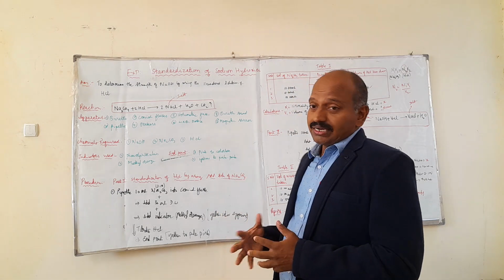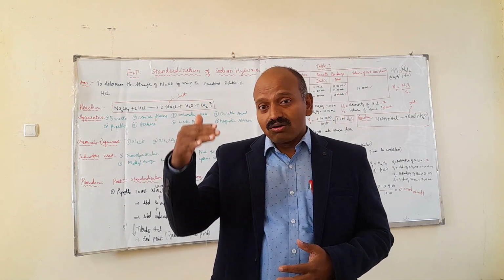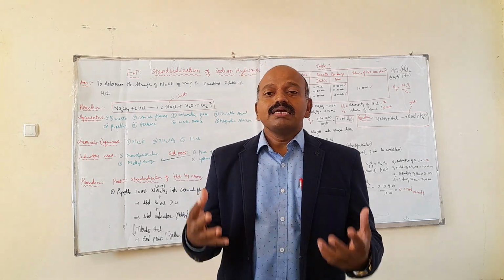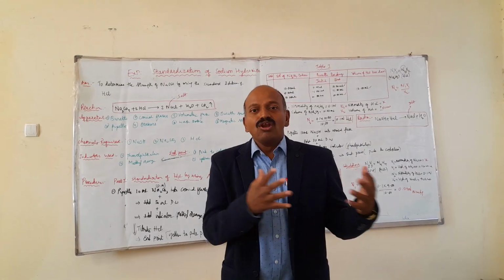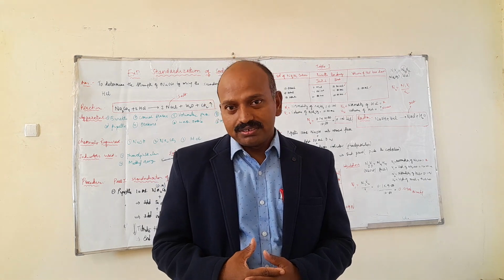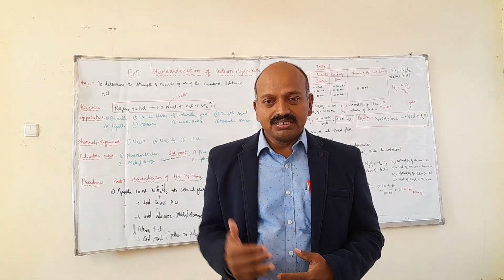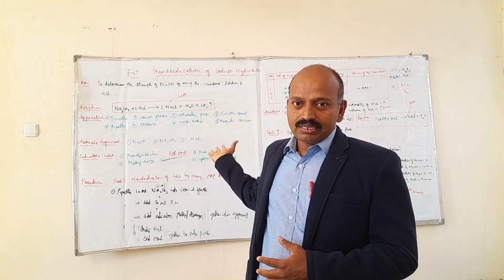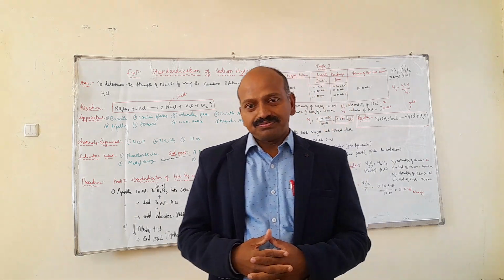When you add the hydrochloric acid into the conical flask containing sodium carbonate, suddenly the endpoint appears and the reaction completes. The yellow color converts into pale pink color. That's it, the endpoint. For example, if the titer value is around 10 ml, then we can report that in the table provided on the board. You can see the board. So this is about the procedure for part 1.